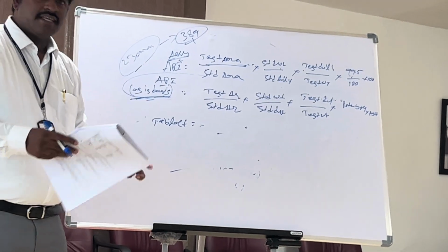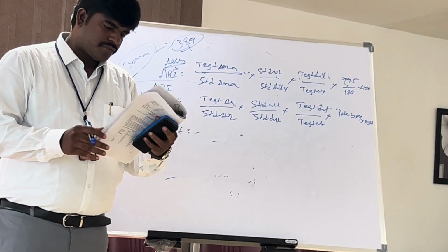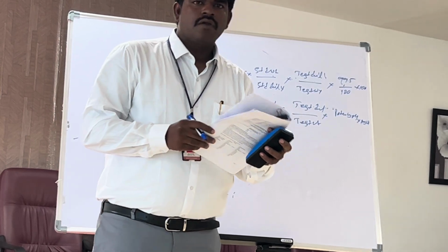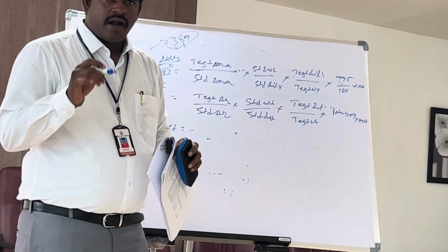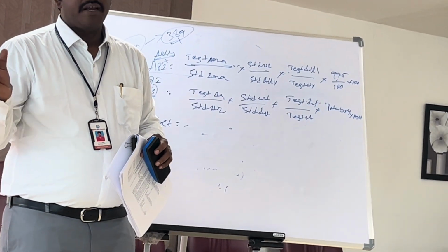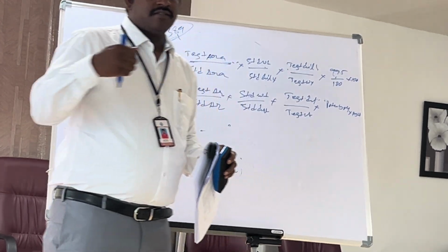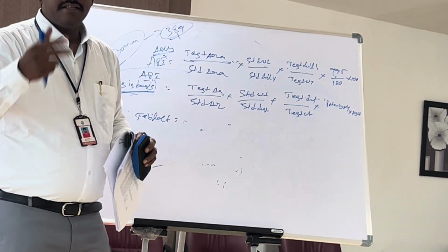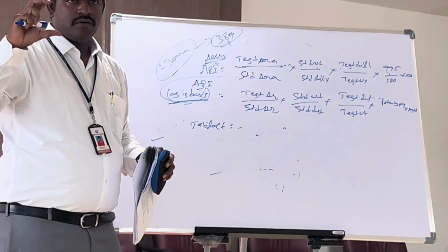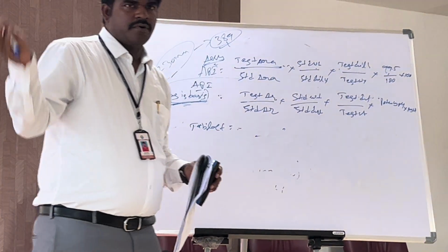If it is a suspension or injection, in those cases what you need to do? Average weight is also there, and apart from the average weight, it includes the weight per ml, that is called specific gravity. Normally, while analyzing any injection sample, weight per ml is the key. Without proper adjustment of the weight per ml, they won't go for further finished product manufacturing.